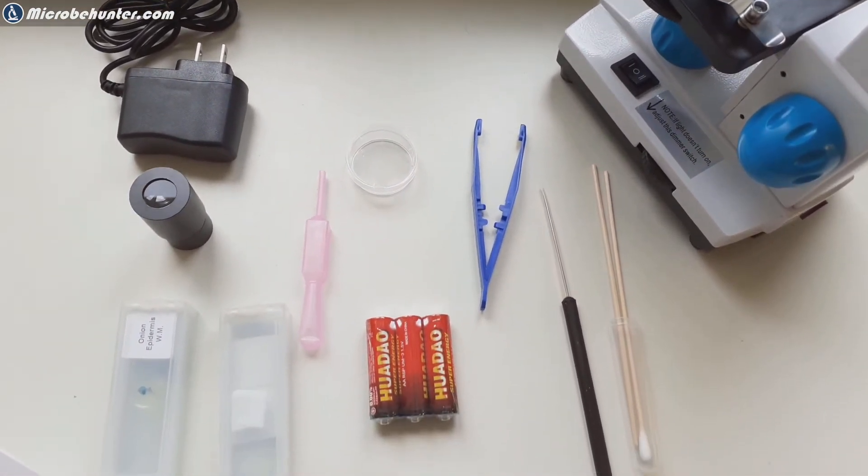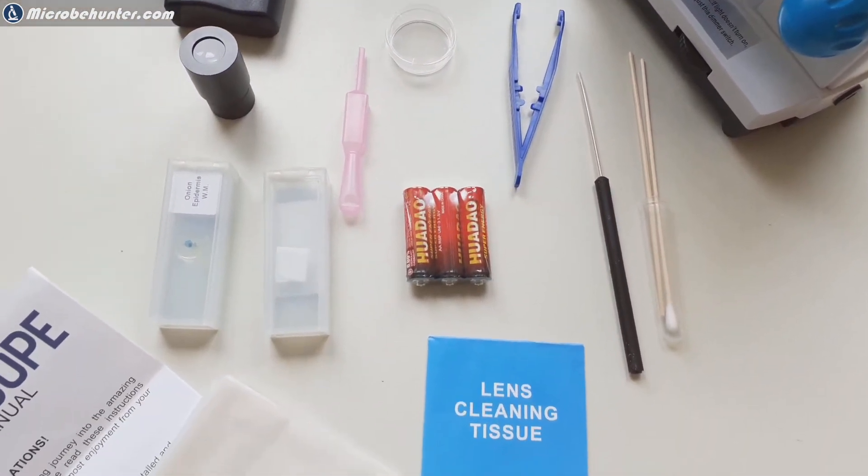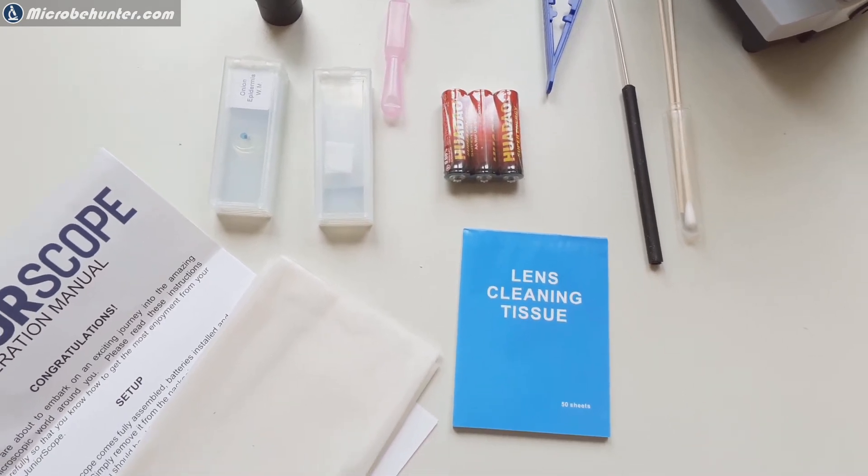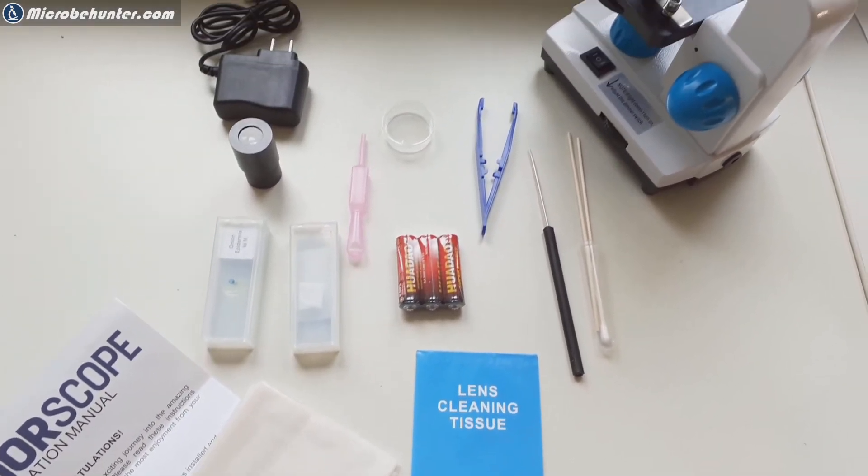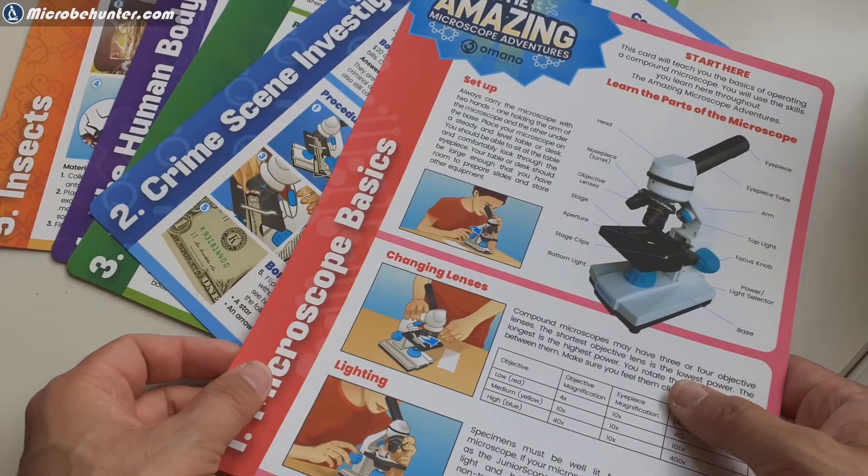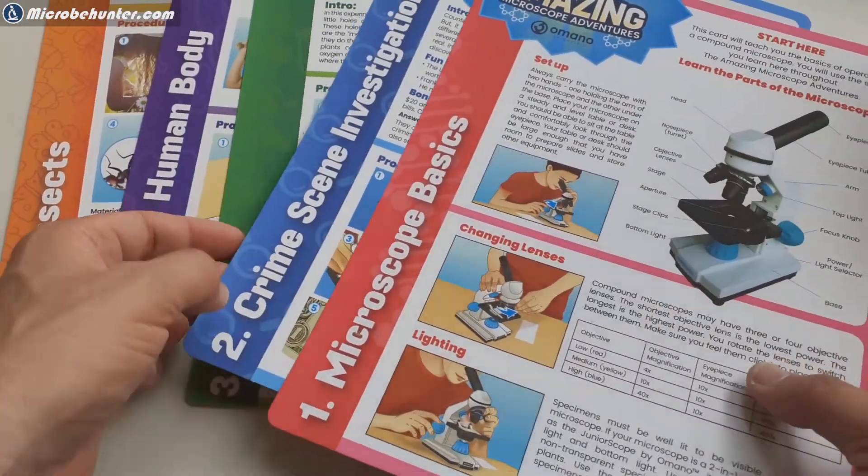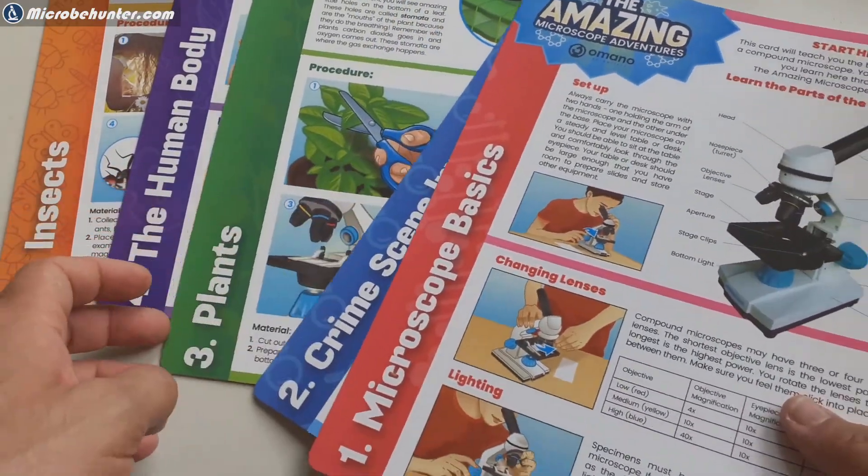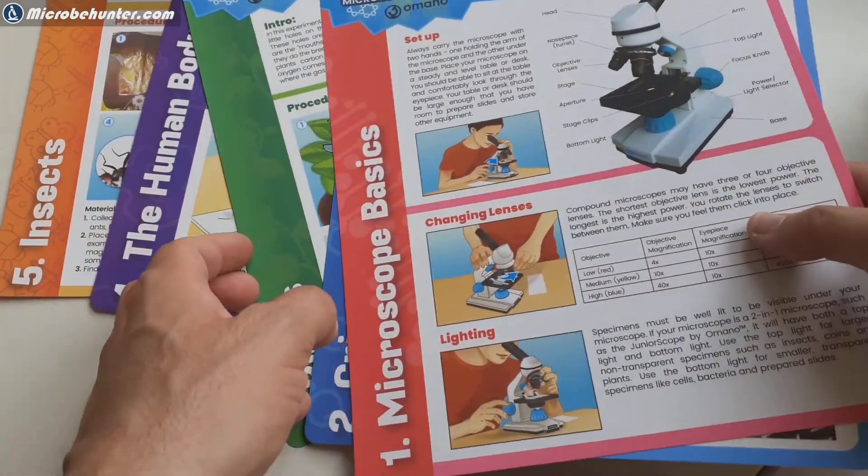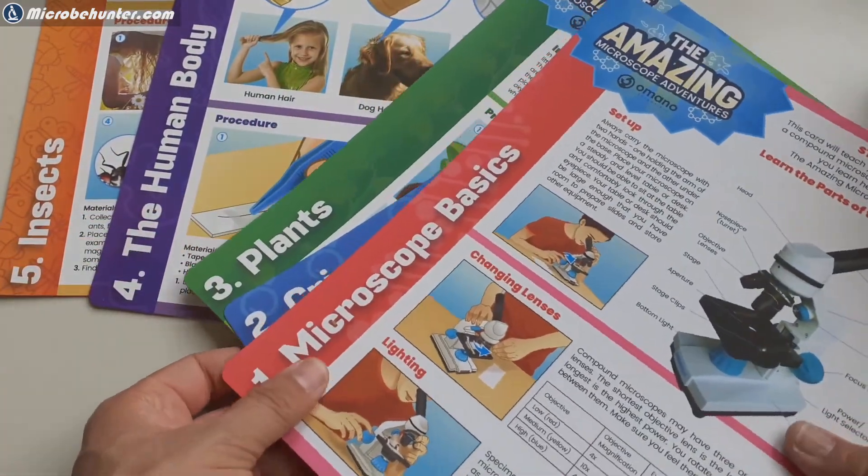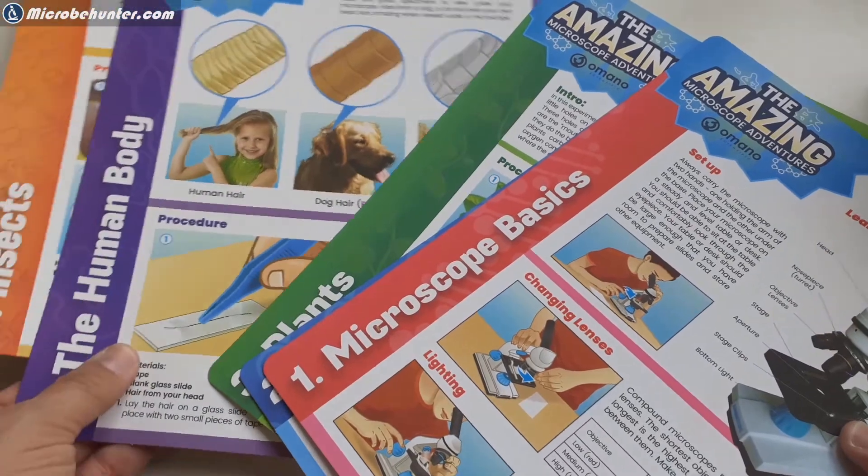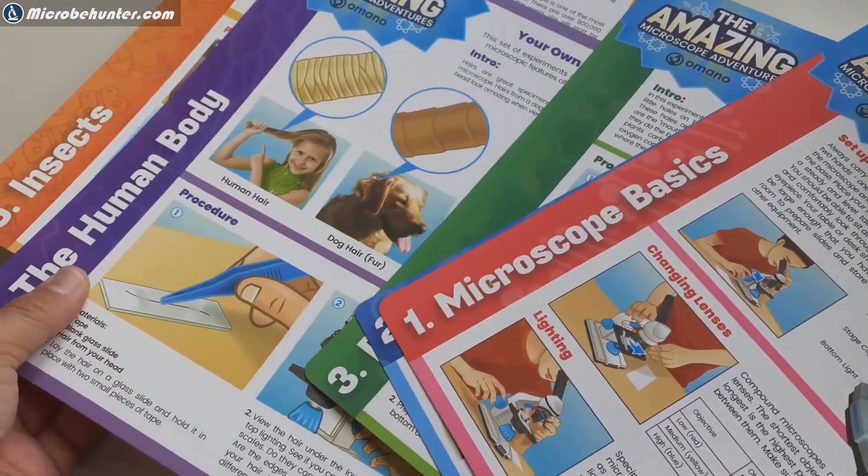So these are all of the parts unpacked and I want to have now a close look at those colorful information cards that came along. So here they are, microscope basics, crime scene investigations, plants, the human body, insects. A variety of different topics, quite nice quality.